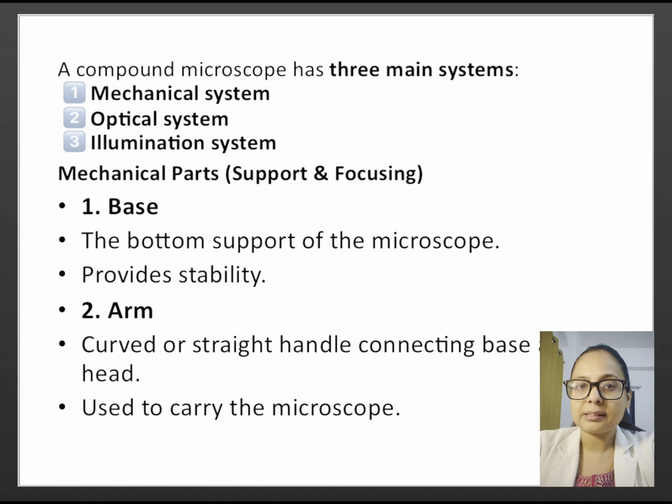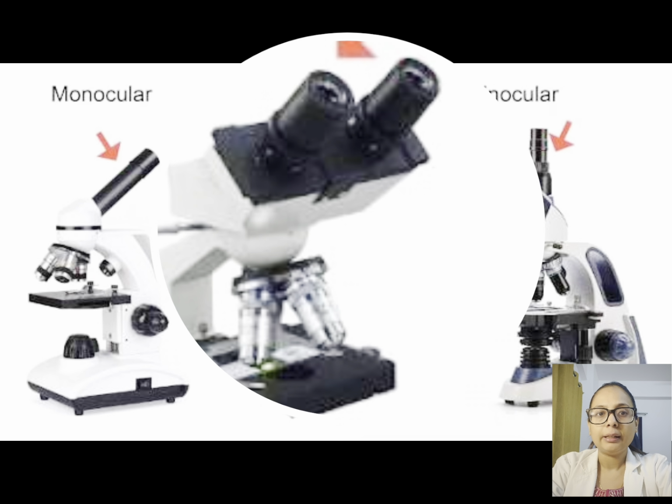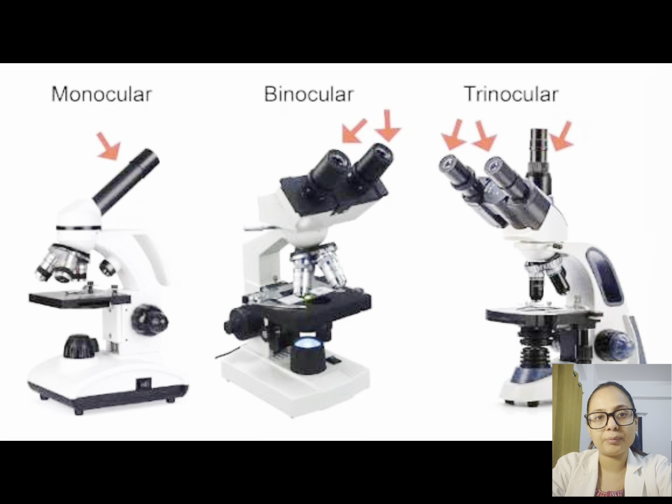We will go through each system while you can see the actual parts on the screen. Also, the microscope I am showing you here is a binocular. What does this mean? It means we will be using both eyes to see the objects.